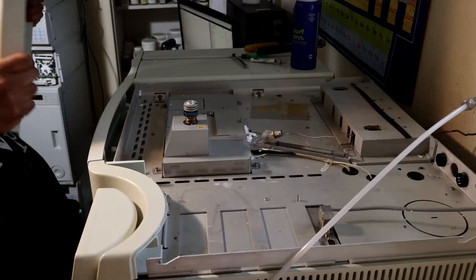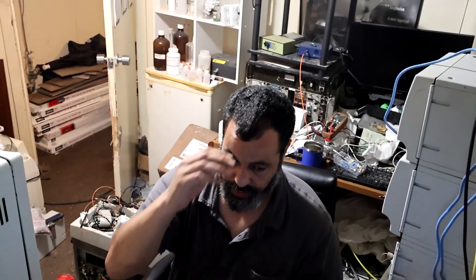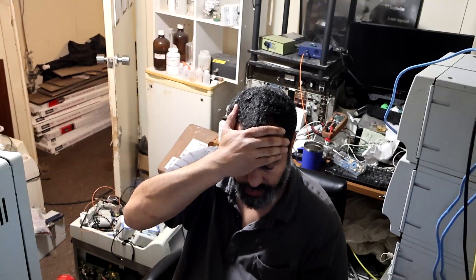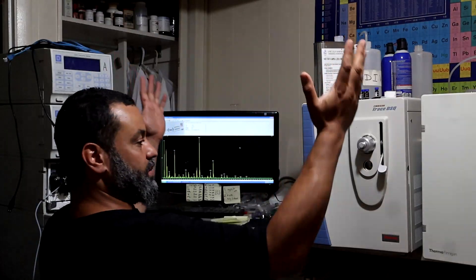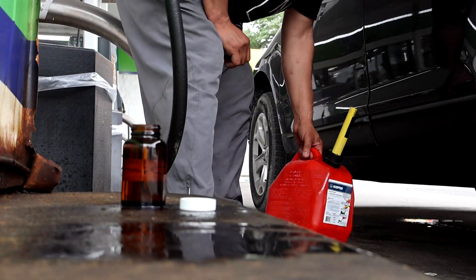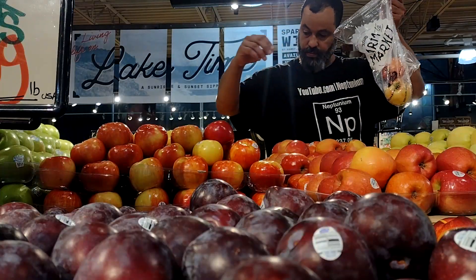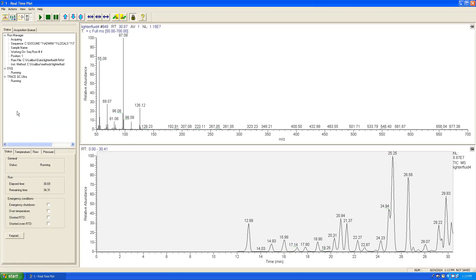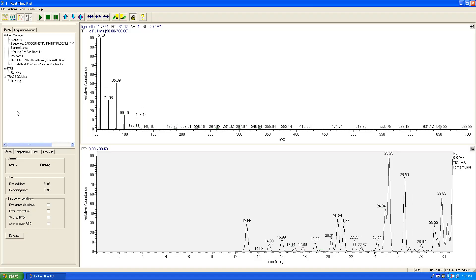Hello and welcome. In the first part of this video, I set up a GC-MS. After many hours of struggle, I finally got it to work and tune, so I immediately started to analyze anything I could get my hands on, like gasoline, toxic plants, foods and drinks, etc. I was only interested in qualifying what I found, and the mass spectrometer allows me to bypass the need for a standard, which is really great.